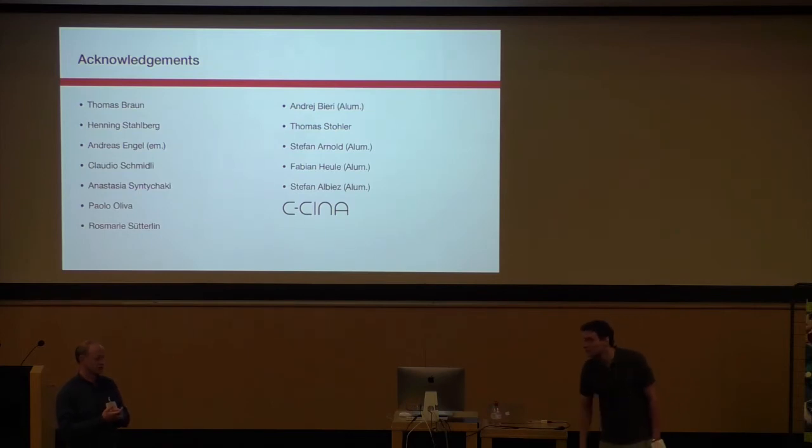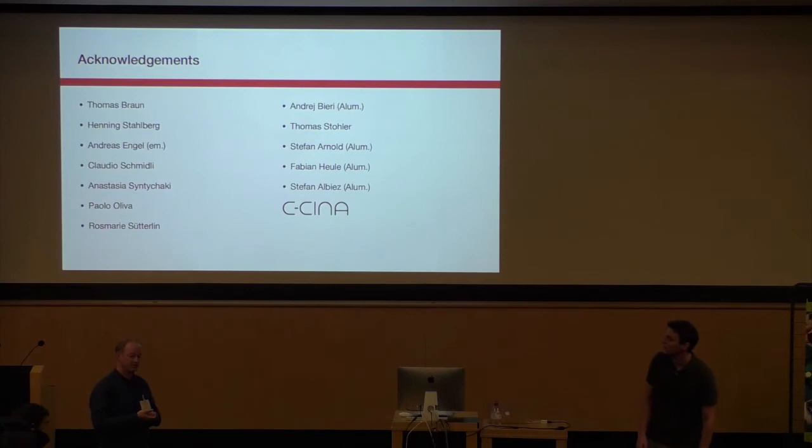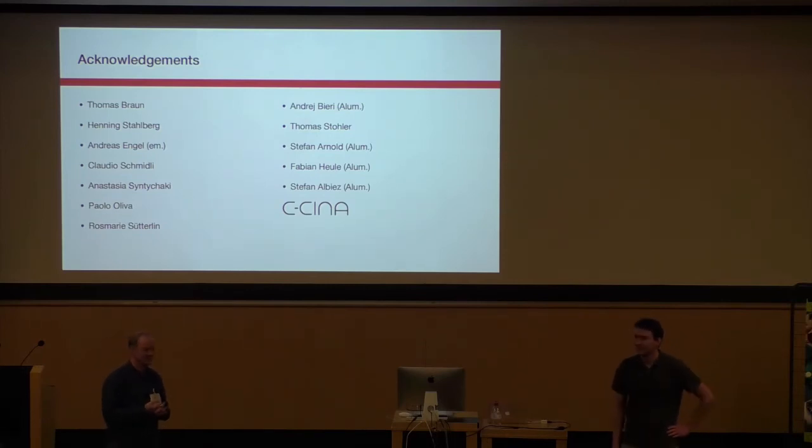No, not completely, no. But the total amount of liquid you really need, because you start spreading and then you soak it away, right? Yeah, so I put 20 nanoliter on the grid, but in the end it's much less, right? So in the end, if you would have 100 nanometers over your whole grid, it was 900 picoliters or something like this, right? So in the end, there remains much less, yeah.